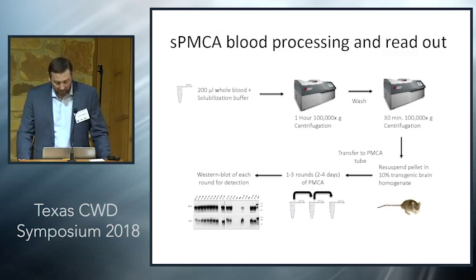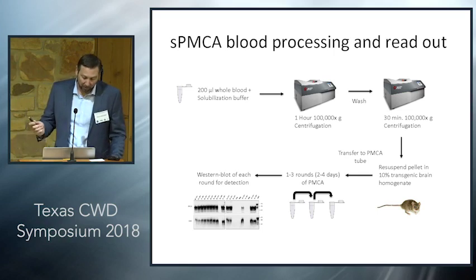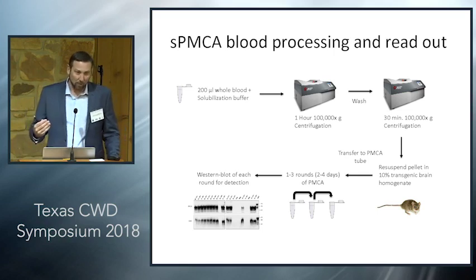For the blood test, a number of purification procedures were required to achieve the ultimate sensitivity, and this technique is exquisitely powerful in detecting a molecule of PrP-Sc. However, it is very laborious, with multiple centrifugation steps and then a Western blot readout, where these samples are handled quite a bit, and it takes a number of days to prepare and then test these samples.